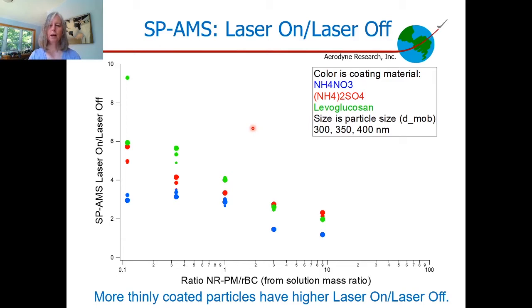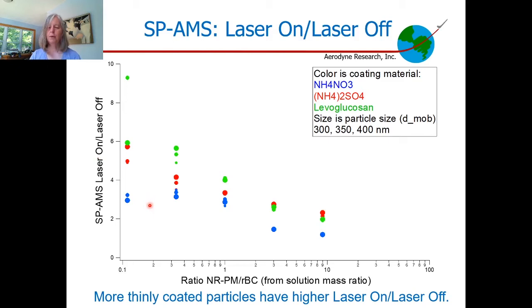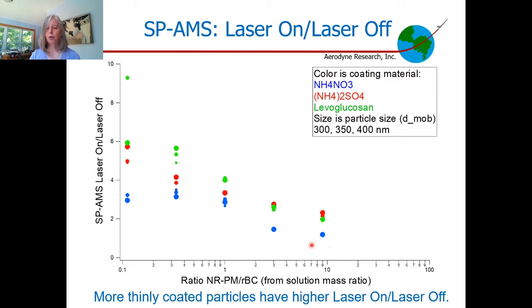For the SP-AMS laser-on to laser-off ratio, plotted on the y-axis, the x-axis is the same ratio of non-refractory to black carbon. Here we have the opposite trend: thinly coated particles have really high laser-on to laser-off ratios, and as more coating is added, that ratio decreases. This is consistent with the bounce measurements: with very thin coatings, many particles bounce and are not detected in laser-off mode, decreasing the denominator and increasing this ratio. When coatings are thicker, most particles are detected by both vaporizers. The ratio remains above one even then, suggesting that relative ionization efficiency is higher in the laser than on the tungsten vaporizer.